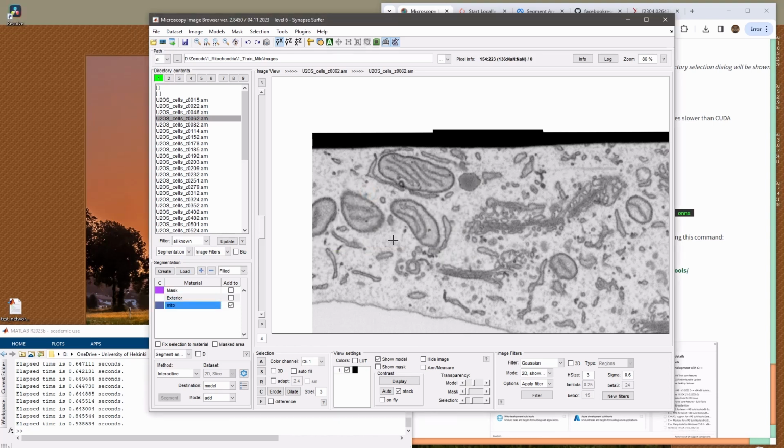And then when I click here, it adds directly to this material. Let's say I click here. You see, it added it with the problem, but while I still haven't released the left mouse key, I'm working on this object. I can hold the Control key and click, and then it gets removed.